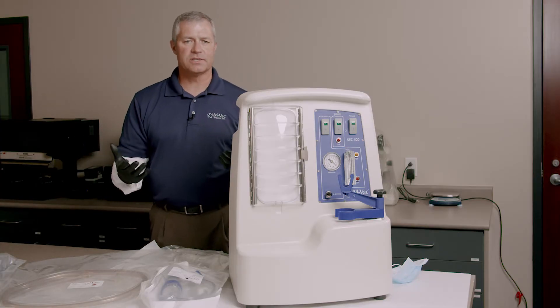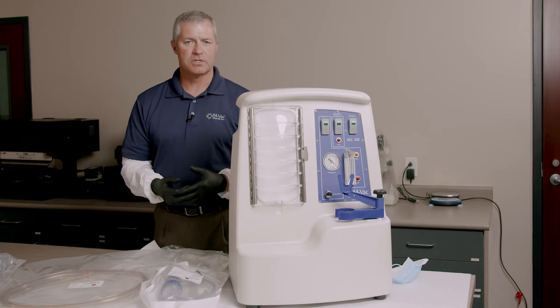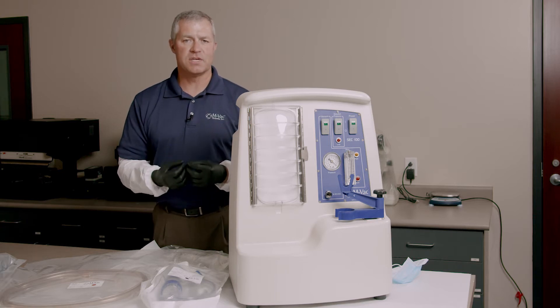In a nutshell, the MVAC is just like a carpet cleaner. It sprays a sterile solution down and vacuums up the DNA. We're going to be showing you really quickly on a couple of different items how that would work.